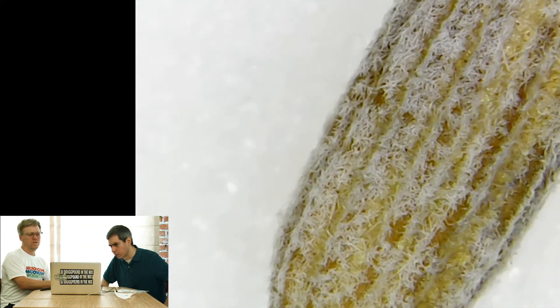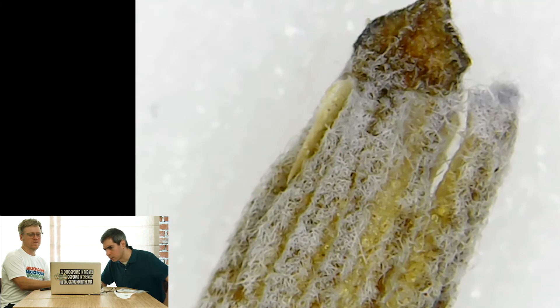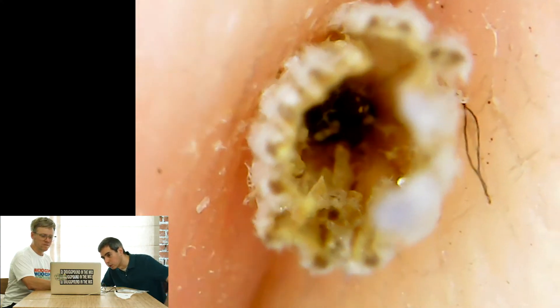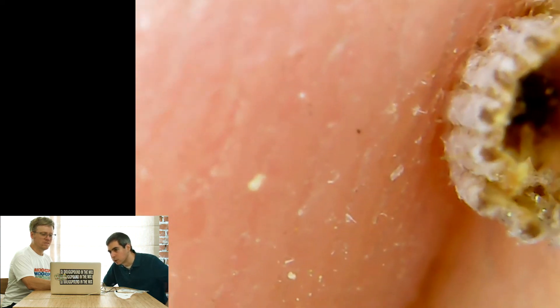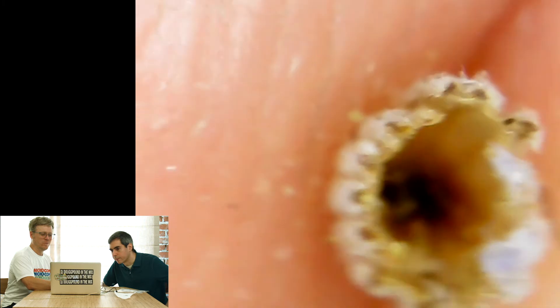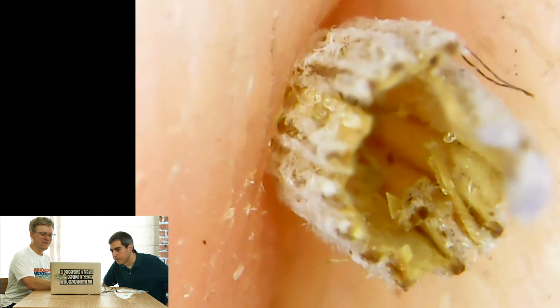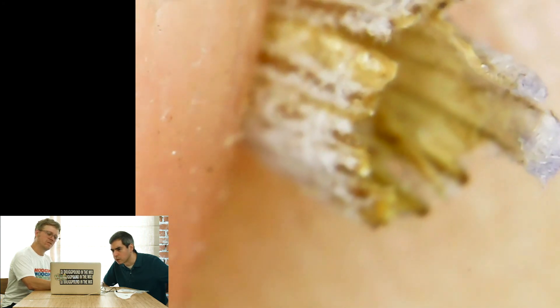That's a furrier seed right here. You see? That one's a furry one. Oh, that's got some... why is it furry? Moldy or something? You reckon that's what it is? Where'd you get it? This is from the same bottle. Oh, you know what? That's just a shell — that's not even a seed. That furry one? Yeah. Oh yeah, there's nothing in there. That is cool. That's the shell of a fennel seed.